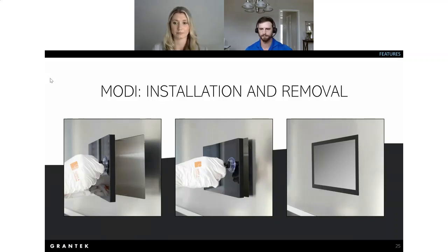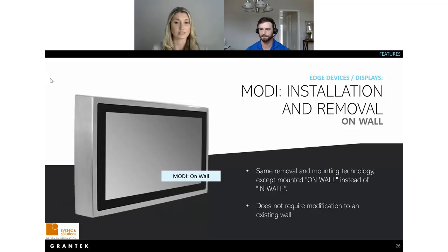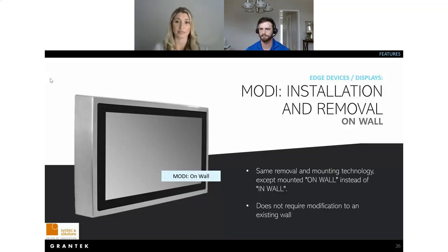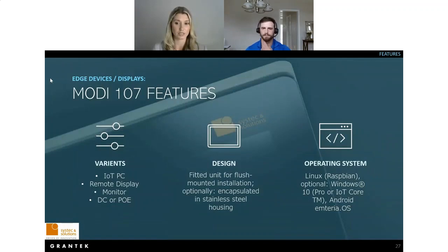Another installation option is on-wall mounting, which is a great solution for those not looking to modify existing wall structures. It uses the same installation technology as the in-wall version, but the Modi is surrounded by a stainless steel enclosure. We offer both 304 and 316L stainless steel based on your preference. It is cleaned the same way — very easy, with rounded edges and no areas for particle entrapment in your clean rooms.